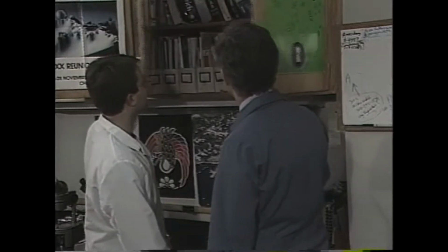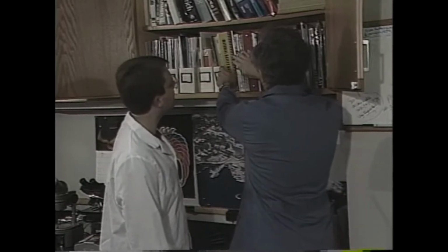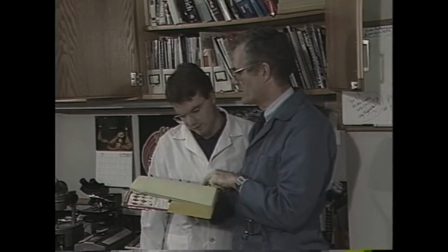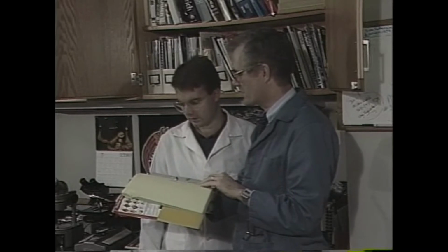The first step is to figure out what hazards, if any, the chemical you are using presents. As you know, the Material Safety Data Sheet, or MSDS, is the primary source for information about a chemical. Your facility maintains an MSDS for every chemical in your laboratory.